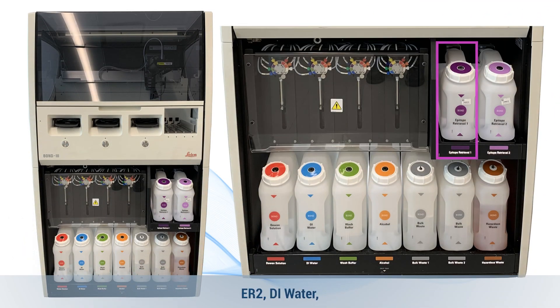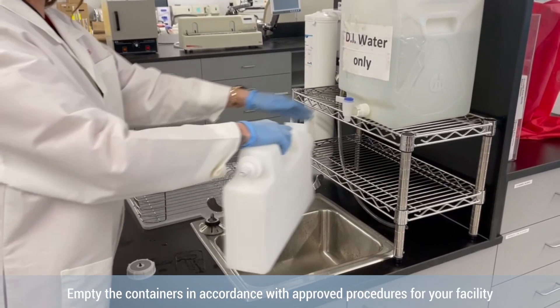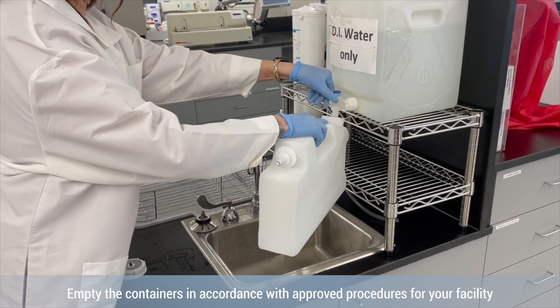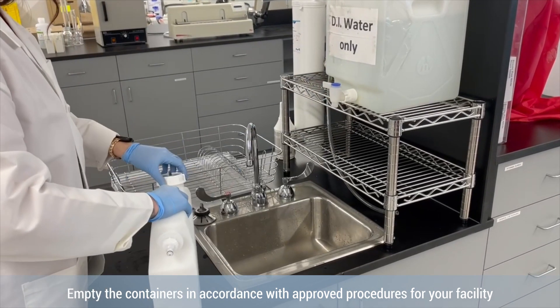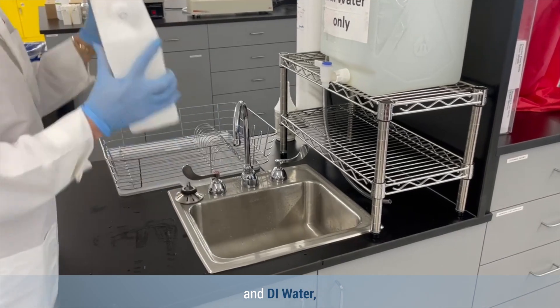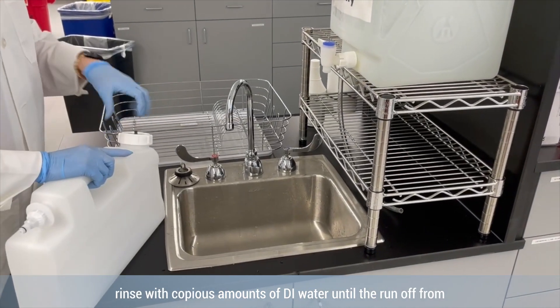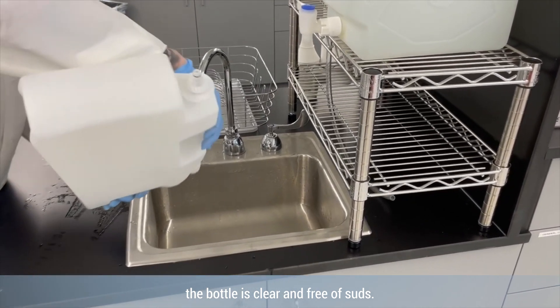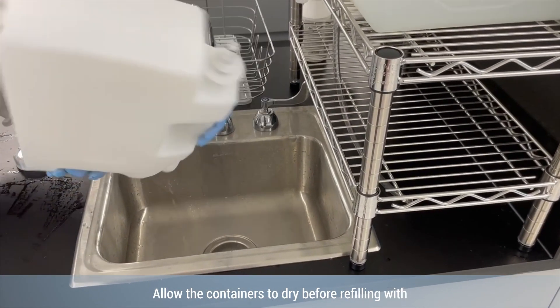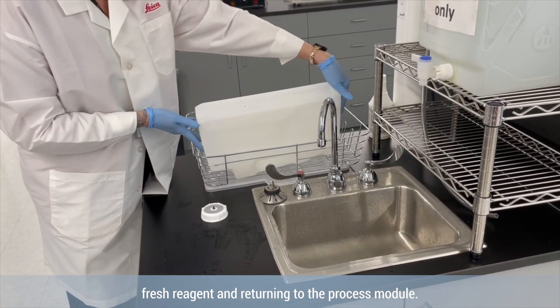Remove the ER1, ER2, DI water, and bond wash bulk reagent containers. Empty the containers in accordance with approved procedures for your facility. Wash containers with a small amount of industrial strength detergent and DI water. Rinse with copious amounts of DI water until the runoff from the bottle is clear and free of suds. Allow the containers to dry before refilling with fresh reagent and returning to the processing module.